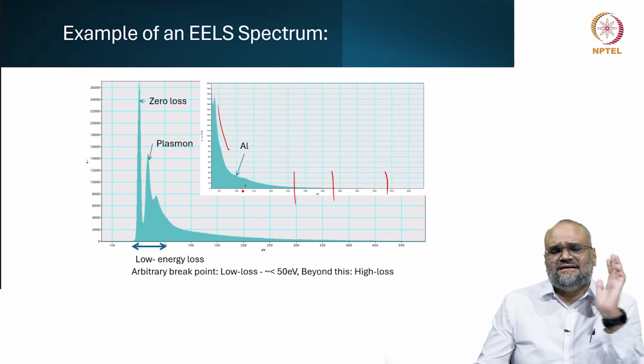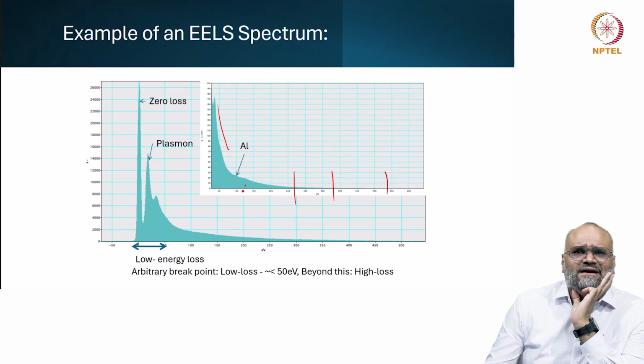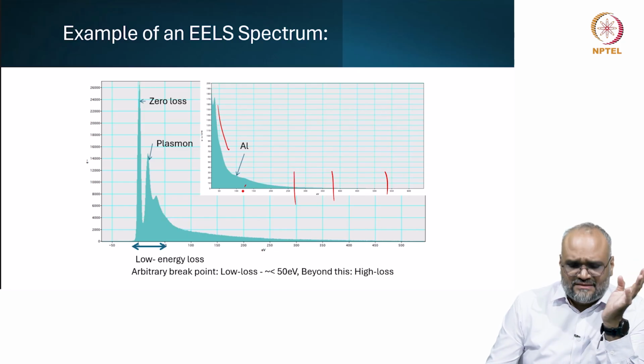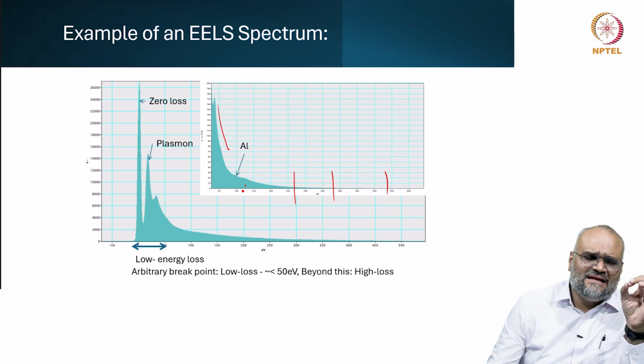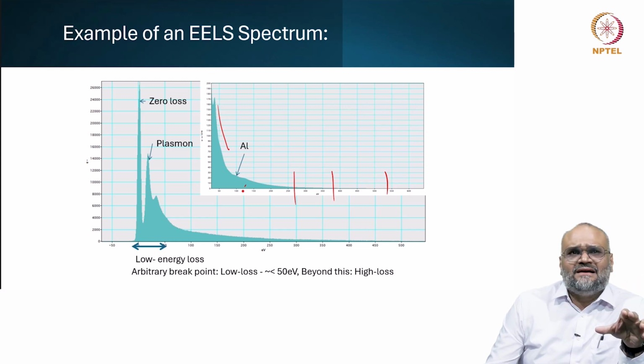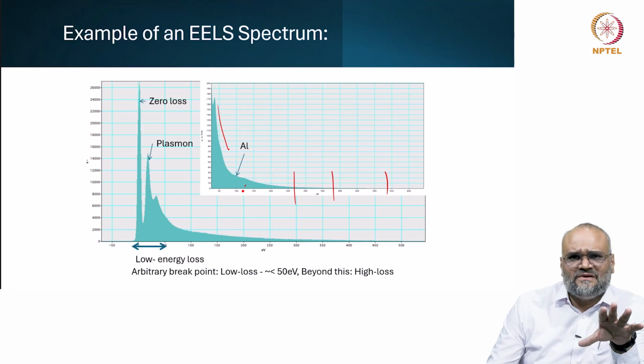The spectrum you record in EELS is analogous to the spectrum you also record in XPS, but in EELS you also have the local position and the microstructural information as well as the electron energy loss spectrum. So, this makes it a very powerful technique.